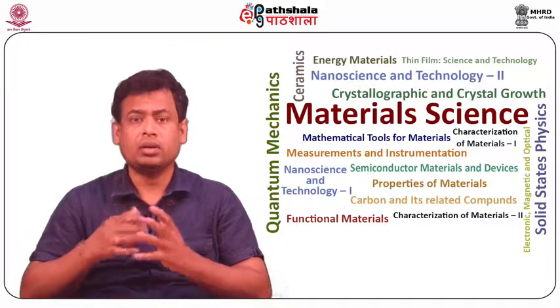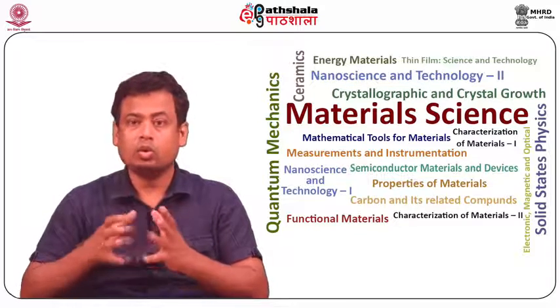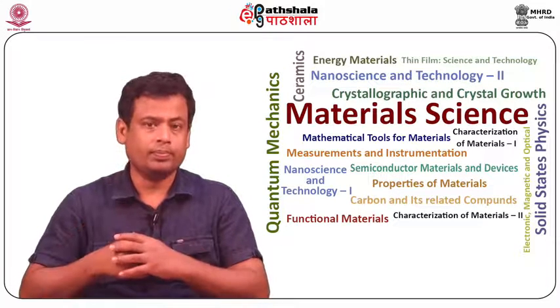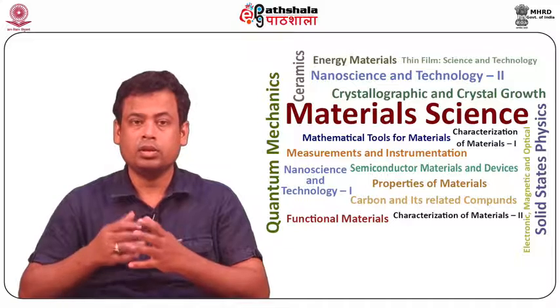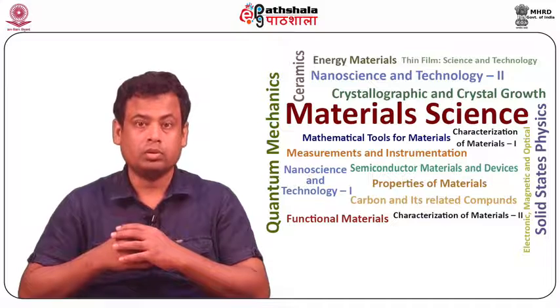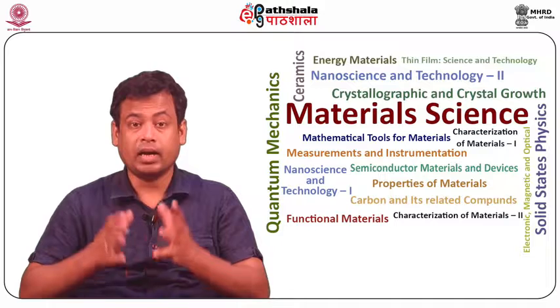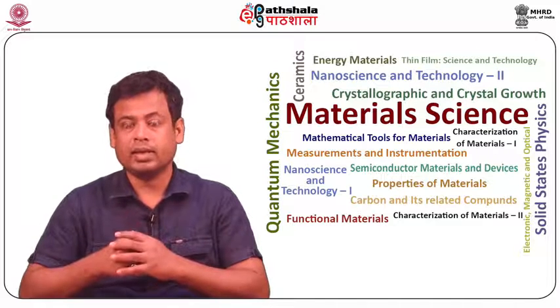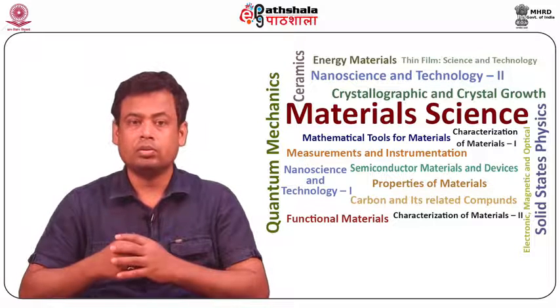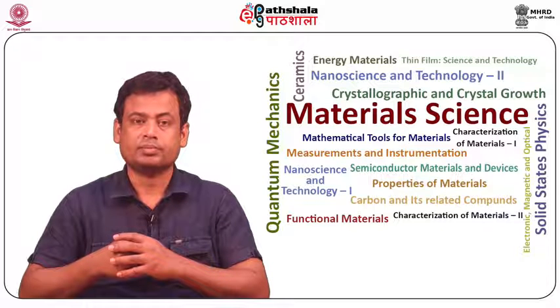The calibration can be done with an internal standard, that is a peak showing little or no chemical shift, as an example of elemental silicon. The most common method is the use of the carbon 1s peak at 285 electron volt appearing from the carbon adsorbed on the surface of the sample. The carbon from organic debris as C-H or C-C in air is found on all samples exposed to environmental conditions.